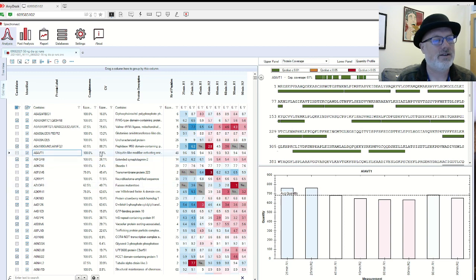You can see, for example, how some proteins look like they're differentially expressed based only on their retention, based only on the gradient. This is what I expect for some of these. Some of them are interesting. Like this one, the protein had a higher response in the shorter gradient than it did at the 60-minute gradient. Why is that? I don't know. That's a good question. I have some theories.